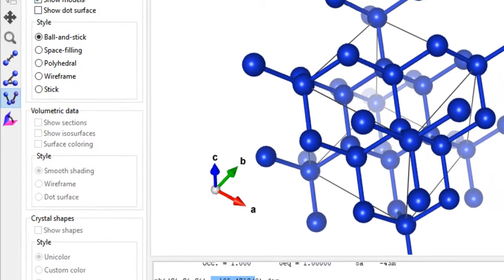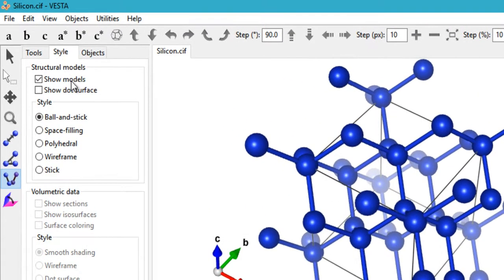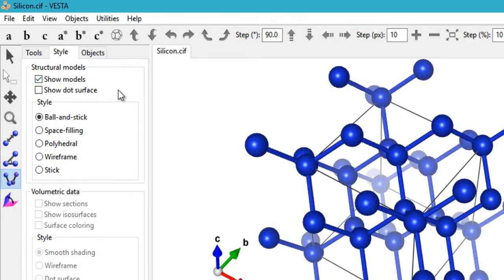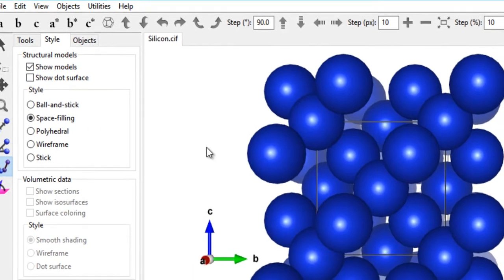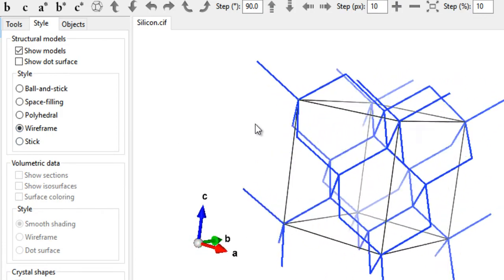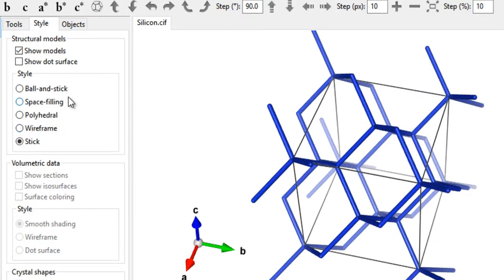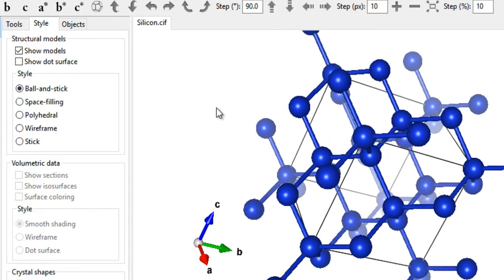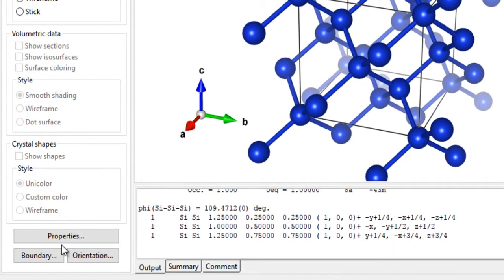There are also tools for measuring interfacial angle and dihedral angle, though I don't use these much. Moving to the Style tab, you can choose how to model your system: dotted surface, space-filling model, polyhedral model, wireframe, or stick model. In my experience, the polyhedral and ball-and-stick models are the two most commonly used.